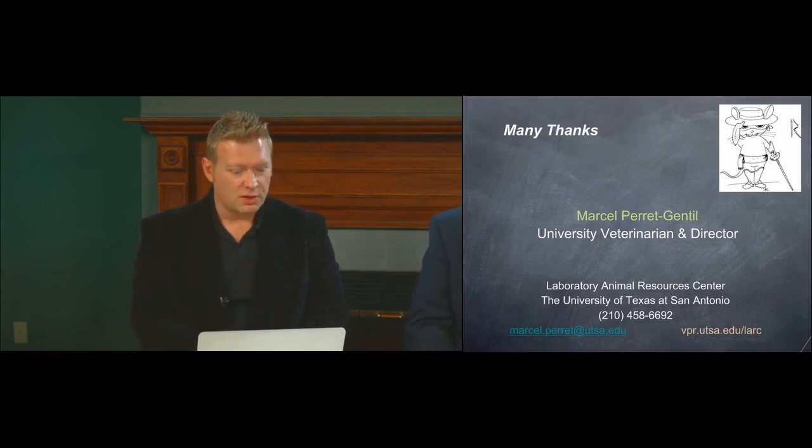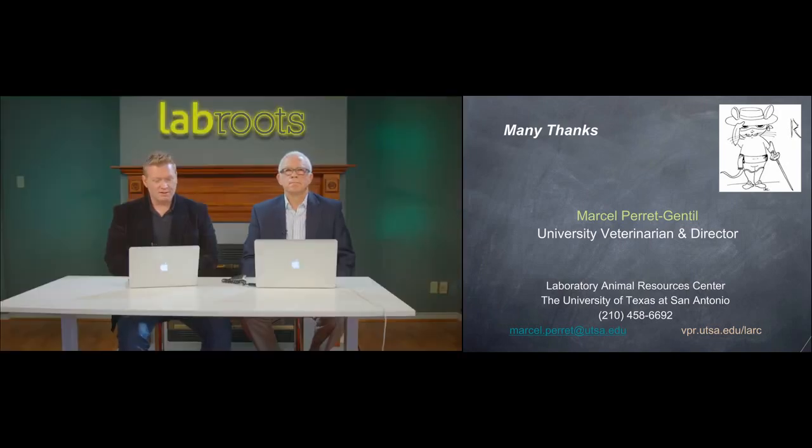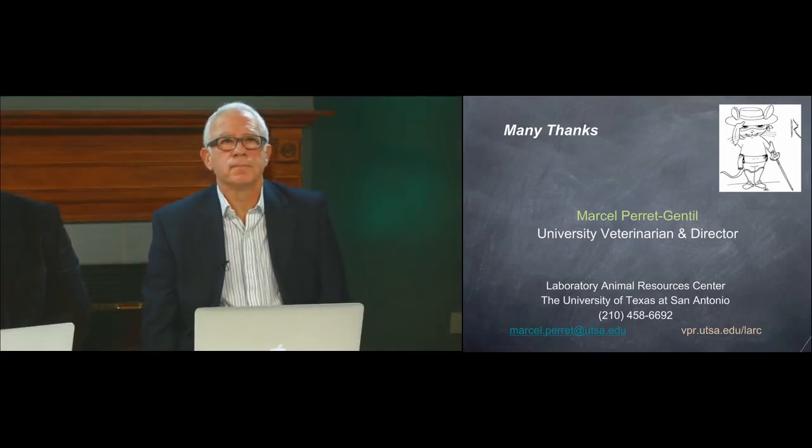Okay, so the first question I have here is from Linda Walla Zix, from Wayne State University. The question is, are there any abstracts available which speaks to the use of press and seal as a surgical drape? We actually published last year a very short little technical advice paper in Surgery Savvy. I'll be glad to send this to you for anyone who requests it.